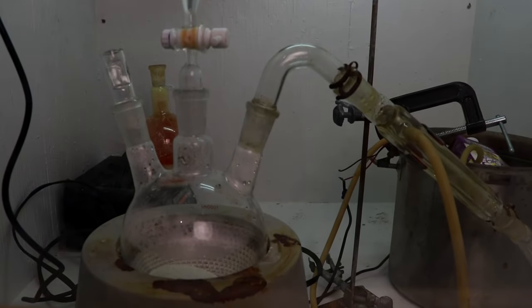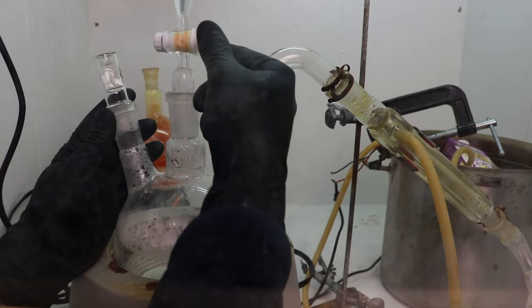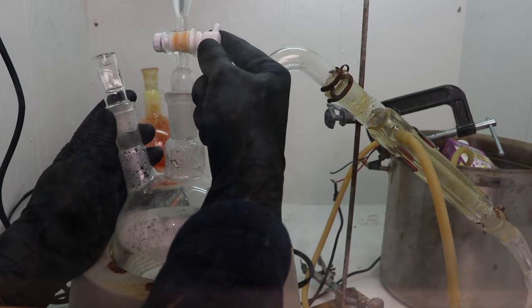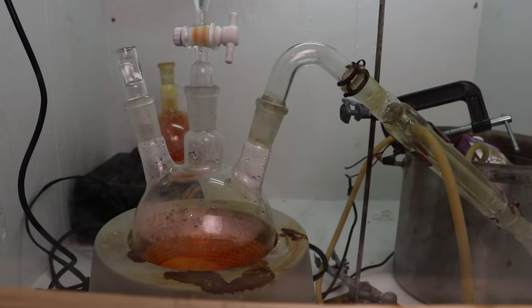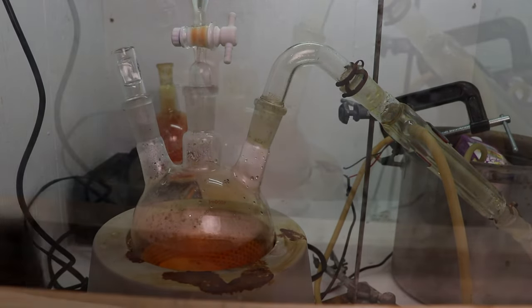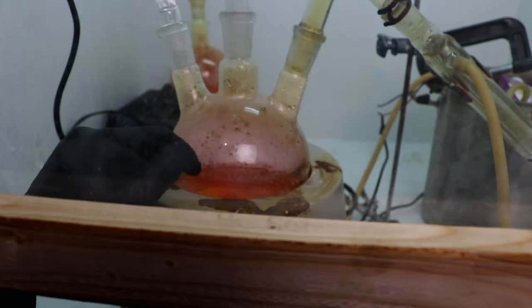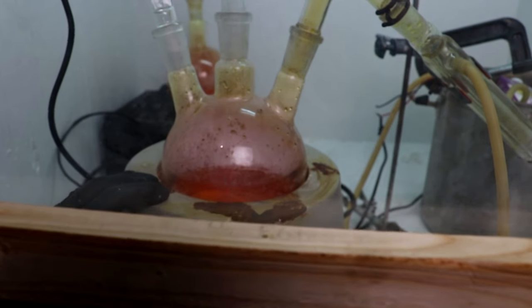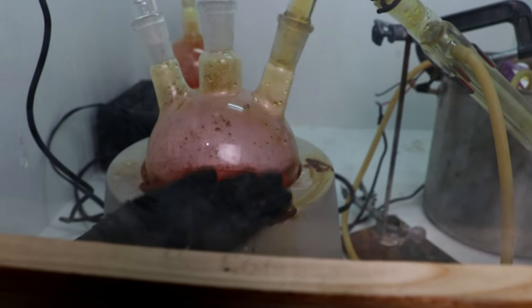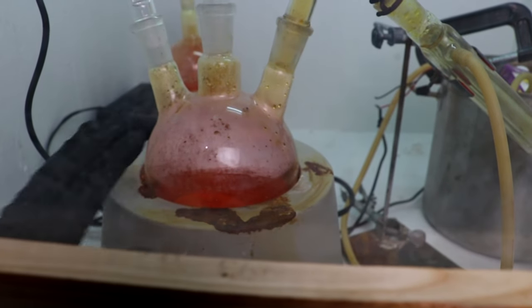Let's add in the hydrobromic acid to the calcium hypochlorite. And we should see bromine forming. There it is. I'm just going to add it very slowly. I'll probably end up with a bunch of liquid bromine in this chamber over here. But I do have it set up in this distillation pot, so I can heat this up and drive it over if it doesn't produce enough heat.